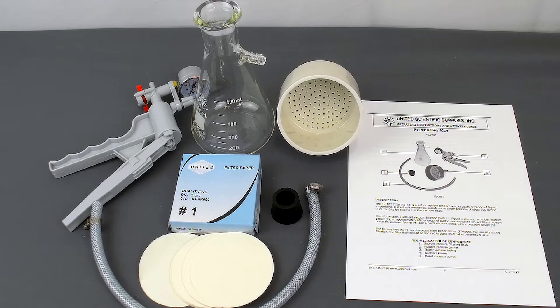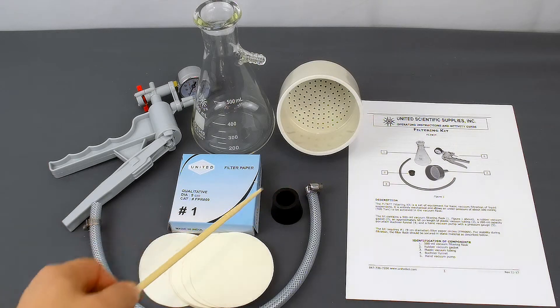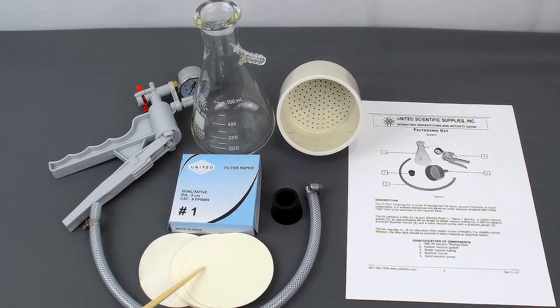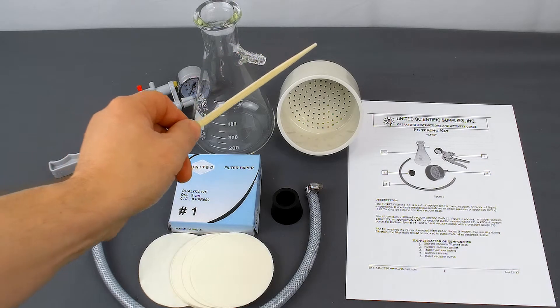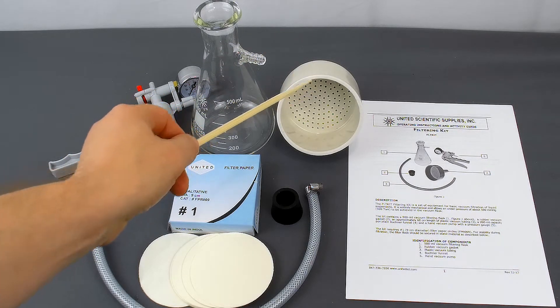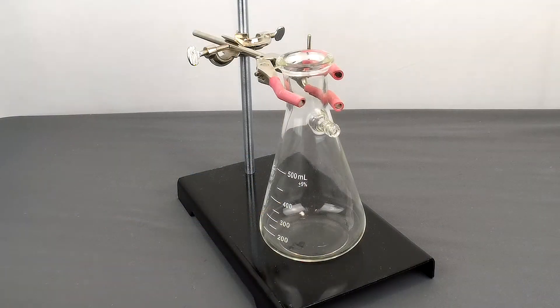The filtering kit is an alternative to the common gravity-based liquid filtration. It comes with everything that you need to perform the experiment: a hand pump, a vacuum tube with radiator clamps on the end, a package of filter paper, a large filtration flask, a Buchner funnel, as well as a rubber stopper.